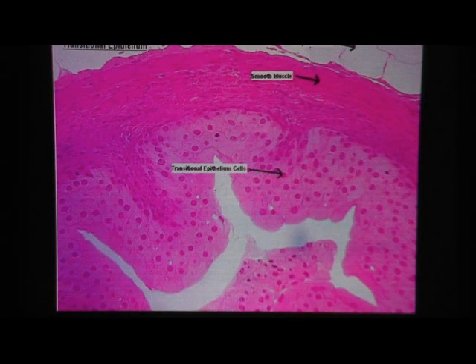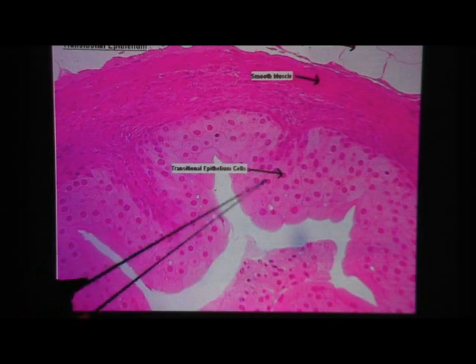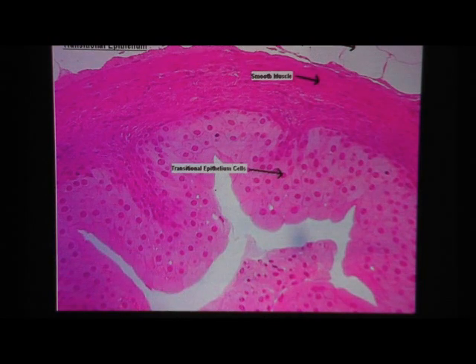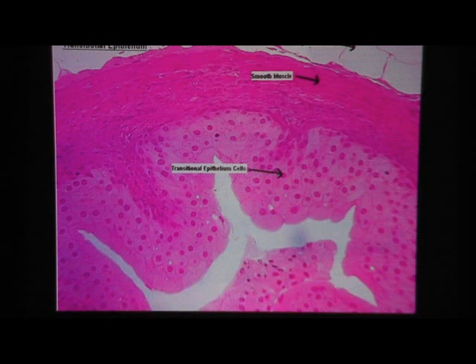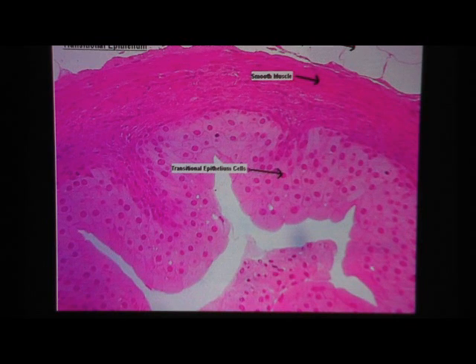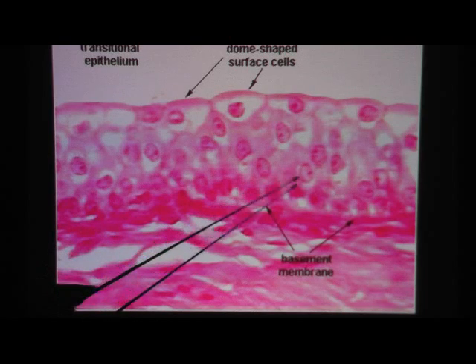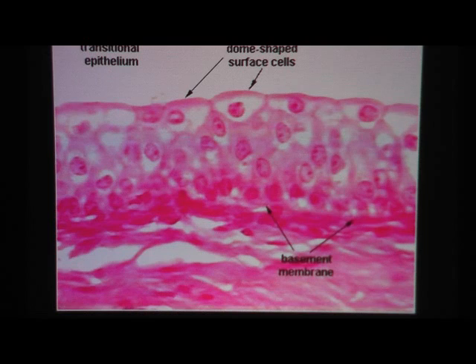Here's another view of transitional epithelium. You can recognize the open space here. The epithelium we're interested in is in the light pink. Each of the round structures would be the nucleus. Notice the round nuclei pretty much distributed throughout the epithelium — that's what gives it away as transitional, versus the next tissue type which is stratified squamous. High power view: transitional epithelium with nice round nuclei throughout, more than one layer for sure, but really no one single uniform shape.